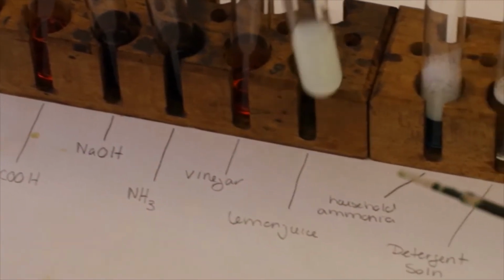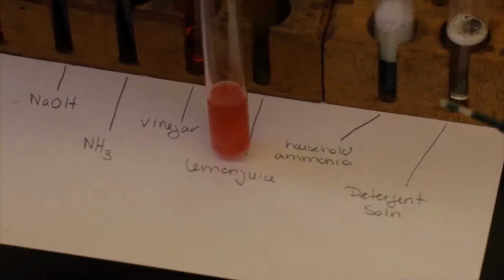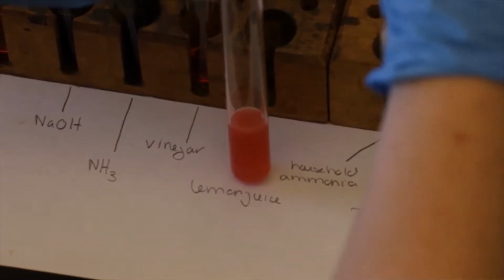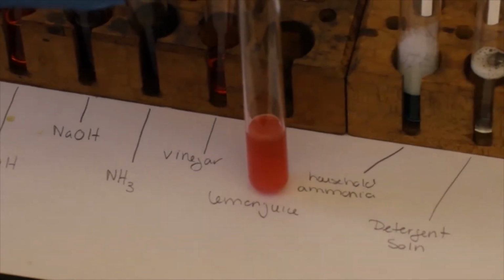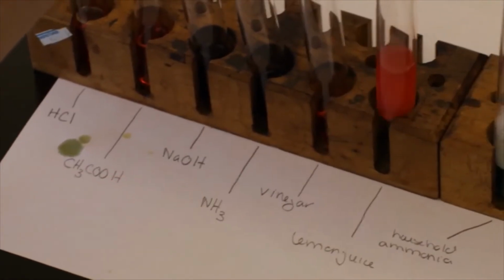And then we have lemon juice. That's this cloudy one, freshly squeezed from a lemon. And again, we're seeing a dark red color. So there's that red. Nice deep dark red. There it is compared to vinegar. It's definitely a darker shade.